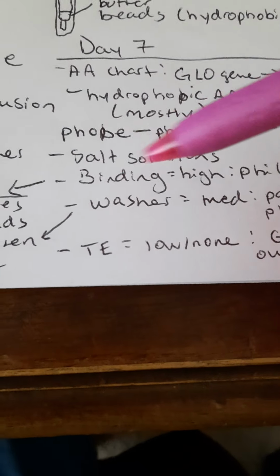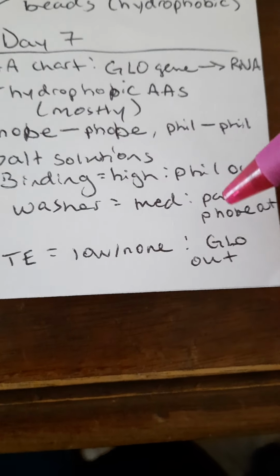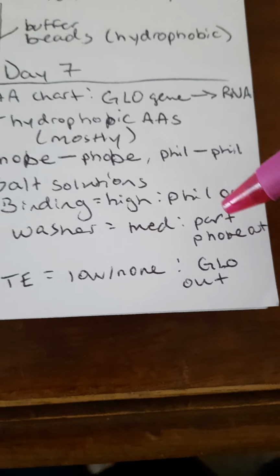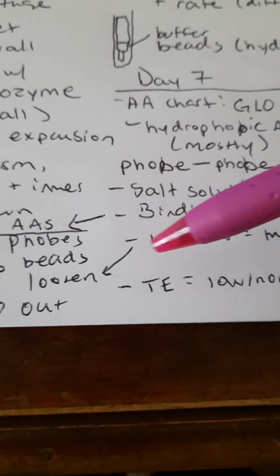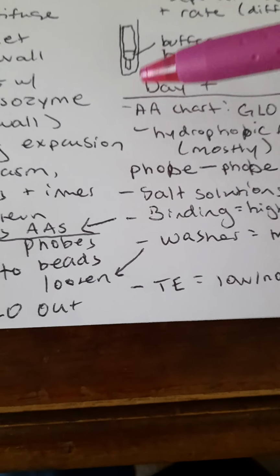And the second, the wash solution, was a medium salinity, and the ones that came out of this into the waste were the partially hydrophobic amino acid proteins. The mostly hydrophobic proteins were still around the beads, but they're loose now, a little bit.